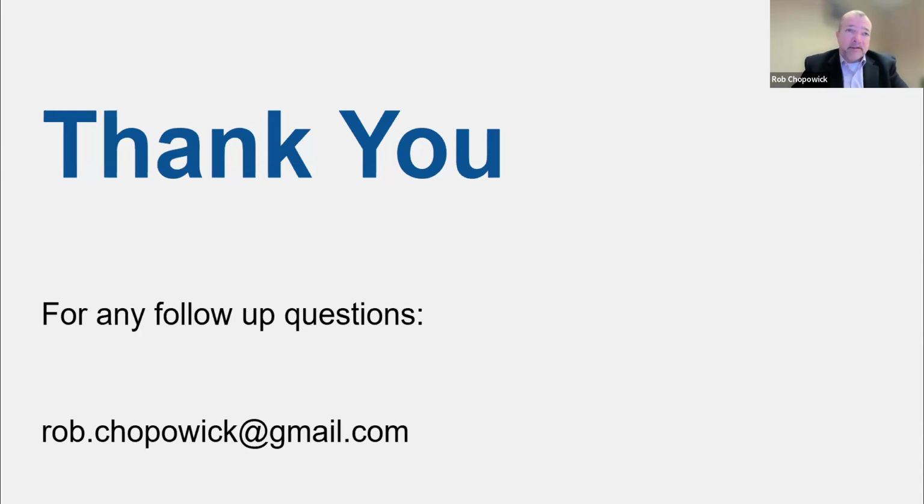So right now, I haven't heard that it's something we're going to implement into the ASHRAE 110 standard. Certainly, the next revision of the standard, where we hopefully get all these things completed, there might be room to open the door to that. But as it stands now, I think those questions are best answered in the Z9.5s and all those other standards that are above the ASHRAE or resting on the ASHRAE.